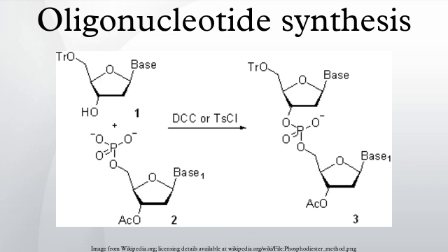Once a phosphoramidite has been coupled to the solid support-bound oligonucleotide and the phosphite moieties have been converted to the P(V) species, the presence of the phosphate protection is not mandatory for the successful conducting of further coupling reactions. In RNA synthesis, the 2'-hydroxy group is protected with the TBDMS group or with the TOM group, both being removable by treatment with fluoride ion. The phosphite moiety also bears a diisopropylamino group reactive under acidic conditions. Upon activation, the diisopropylamino group leaves to be substituted by the 5'-hydroxy group of the support-bound oligonucleotide.